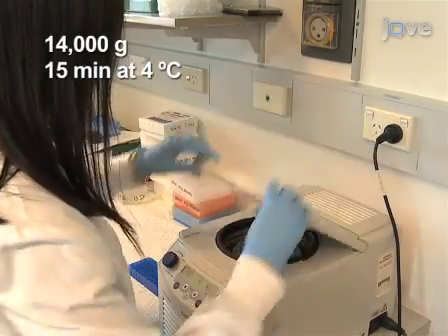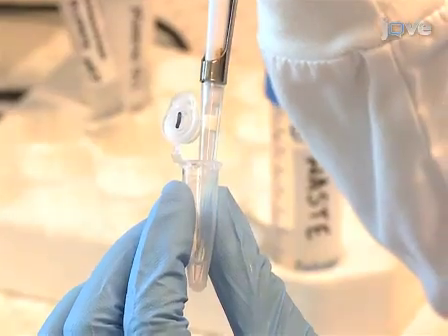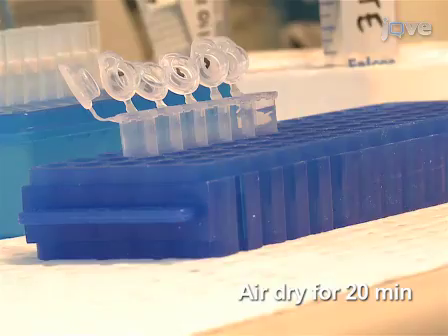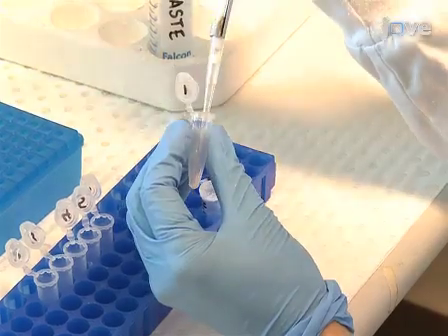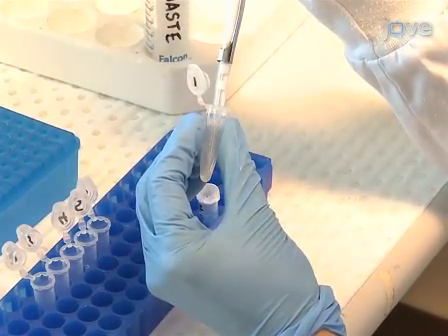Centrifuge at 14,000 G's for 15 minutes at 4 degrees Celsius. Then remove all traces of supernatant and air dry the precipitated DNA for approximately 20 minutes. After air drying, the pellet is almost impossible to see. Re-suspend the DNA pellet in 50 microliters of 0.1X TE or water.